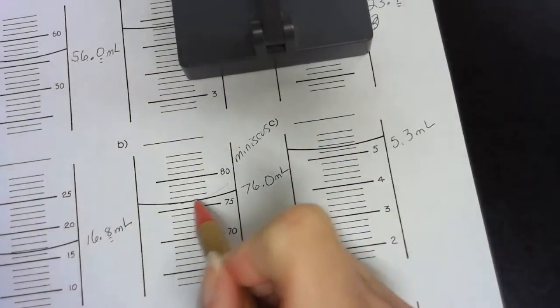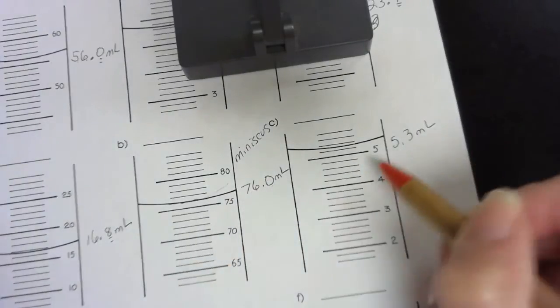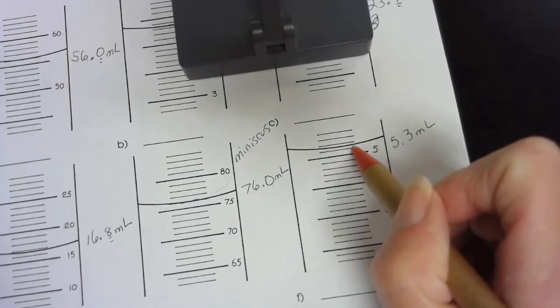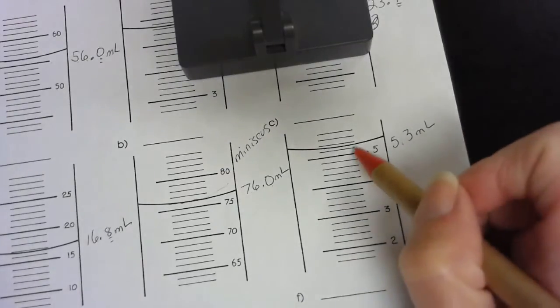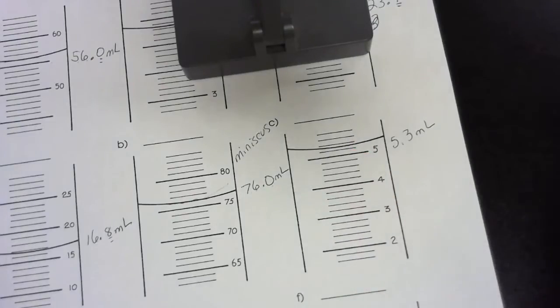Okay, now this I understand could have caused you a little problem because on the other ones, we had 2 digits that we were for sure about, and then that final digit we estimated. And then on this one, we're pretty sure that this is 5.2. So you might have been tempted to add a third digit there, but in reality, think about it. We can't be positive that it is exactly 5.3. So that one would be reported as 5.3 being your significant figures in measurement.